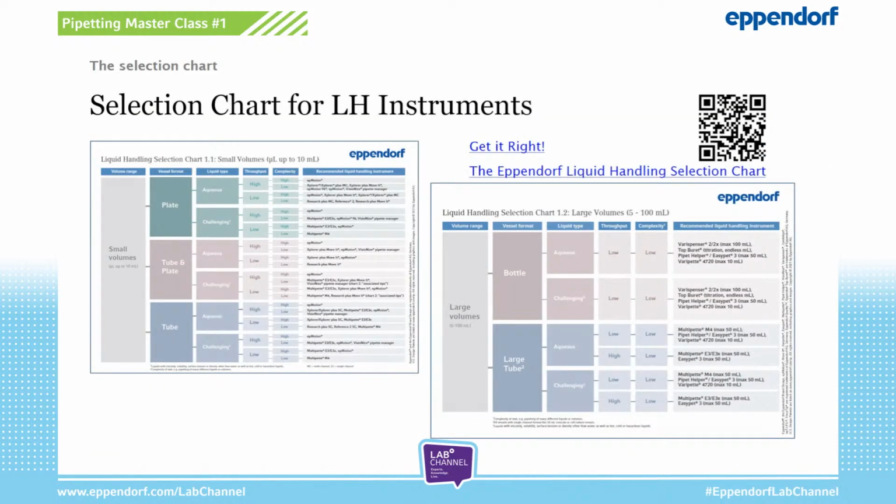So I hope that these two examples have shown that you can find the right liquid handling tool from the wide range of tools available by just answering 5 questions about the pipetting task you are planning to perform. So I think it's quite easy.